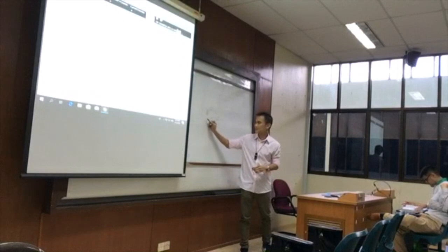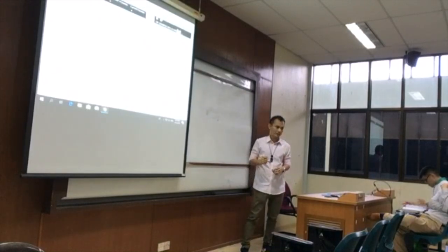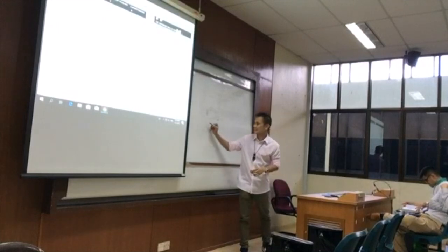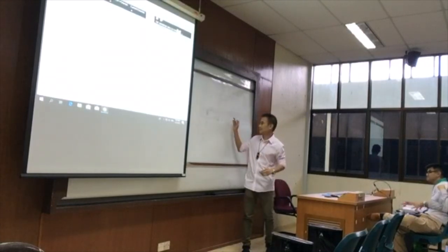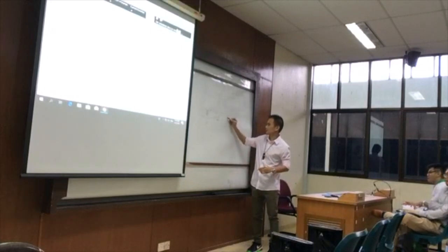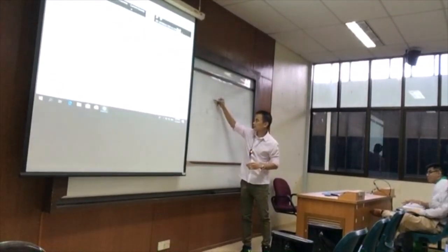And you have this gene, which is 16S. So that means bacteria number 2, say, is unknown.